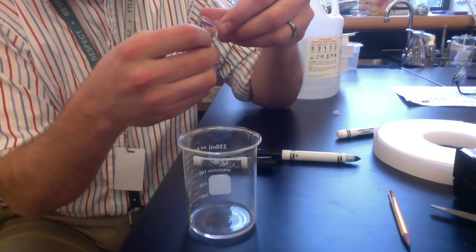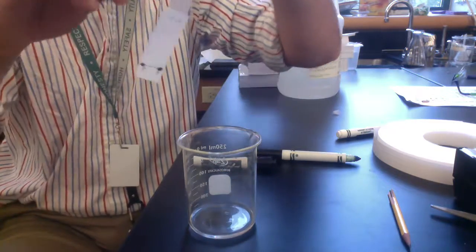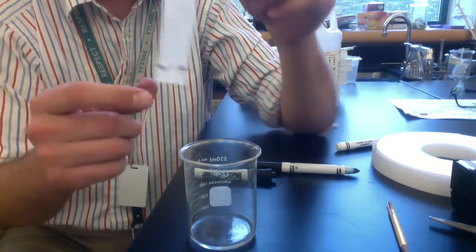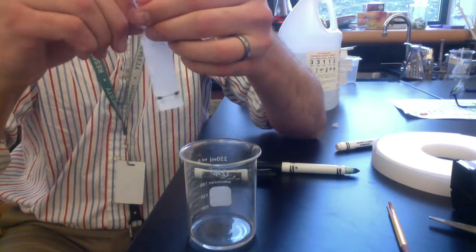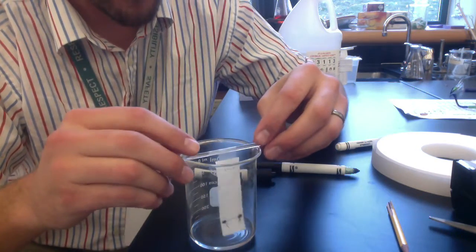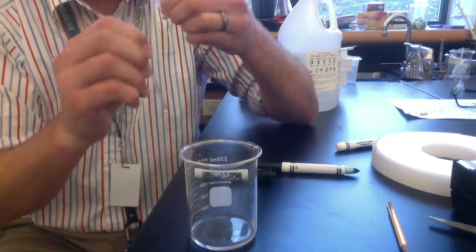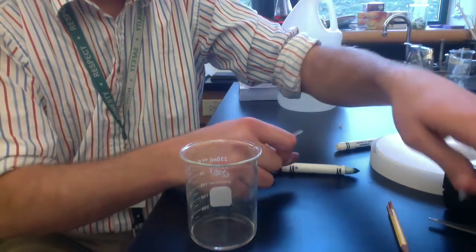So let's see if I can get this. Sorry, multitasking is not always my forte. So let's move it. That's fine right there. Okay, so that's going to probably be a little bit too deep. One thing you want to avoid is dunking the ink itself into the water. And how does that look right there? And that's too far. So, as you can see, there's a little bit of an art to it, and I'm just totally botching it right now.